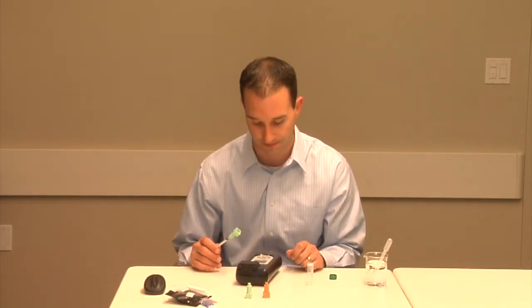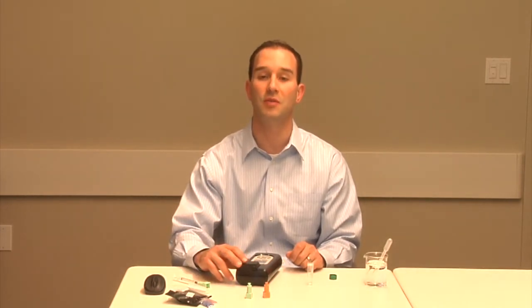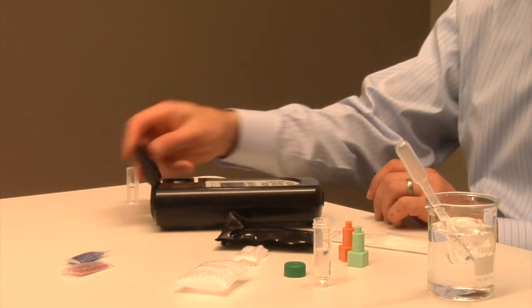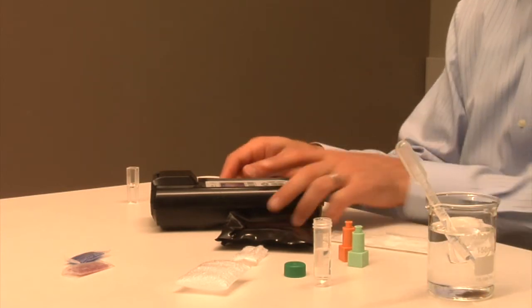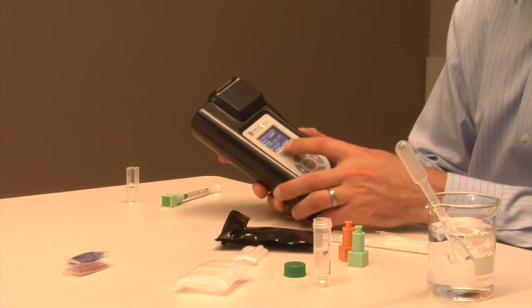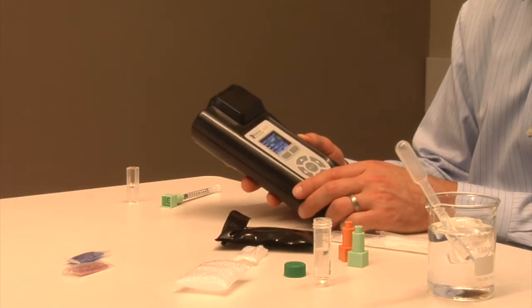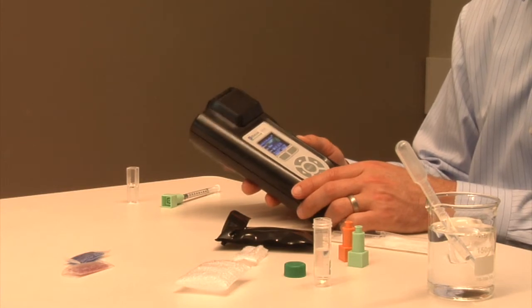Press the start button located just below the screen to test the sample. This should take about a minute. When indicated, remove the cuvette from the sample chamber to prevent spilling and fouling. The results will be displayed in parts per billion. To save the results, press the Save button. As in my case, a reading of below 2 parts per billion limit indicates the amount of lead in the sample is below the minimum detectable levels in the instrument.